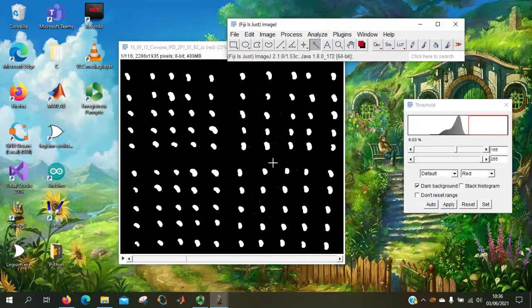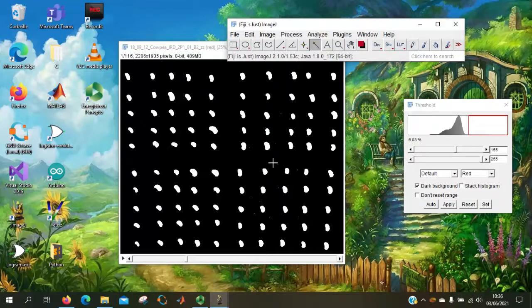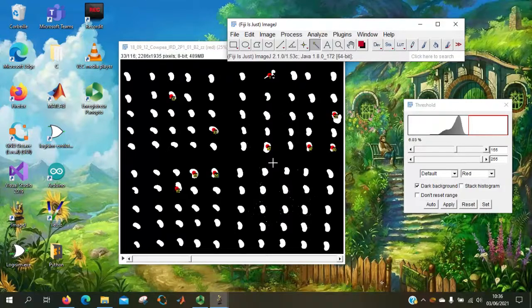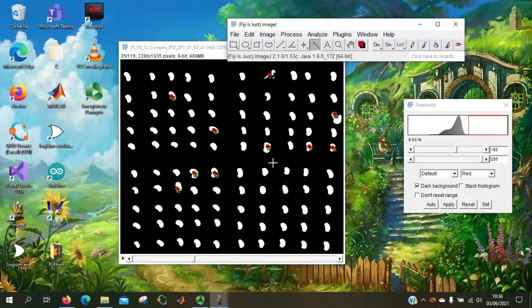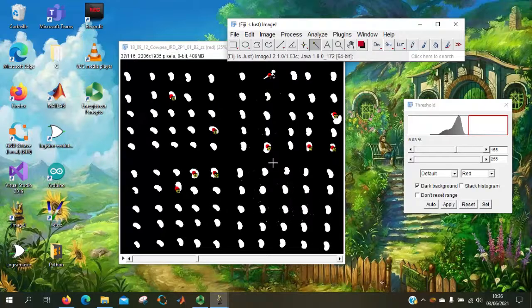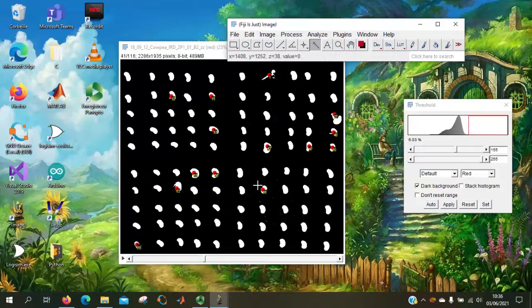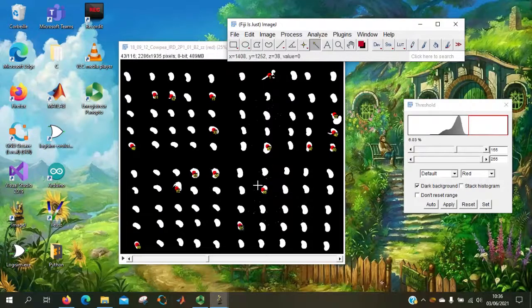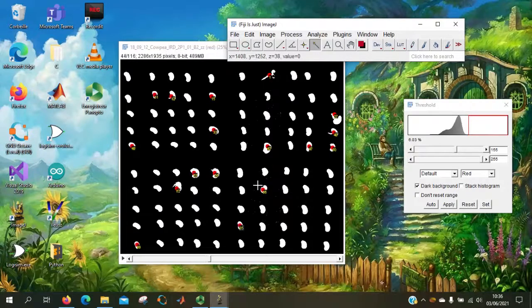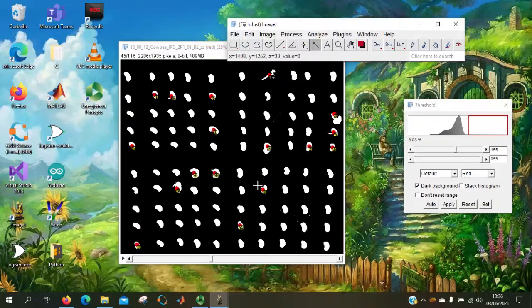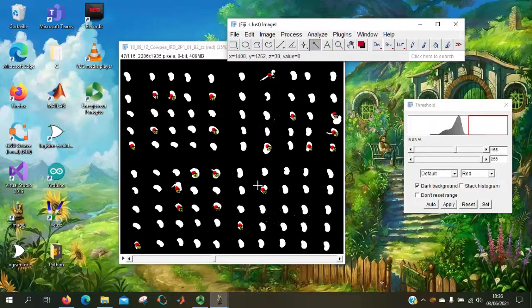So it has to check 11,600 positions because there are 116 images and 100 seeds.